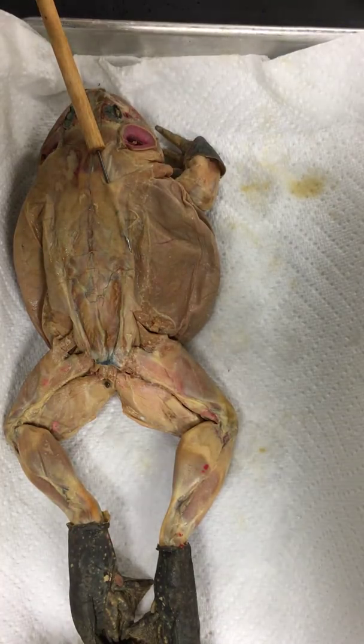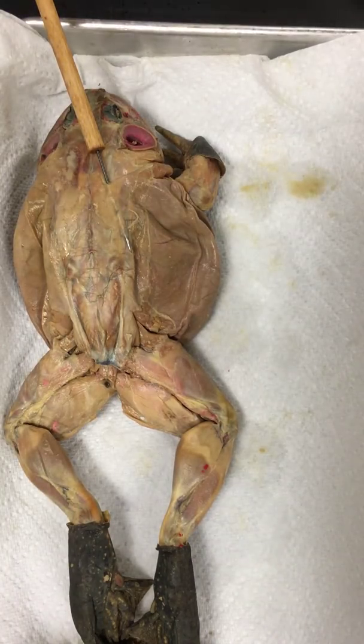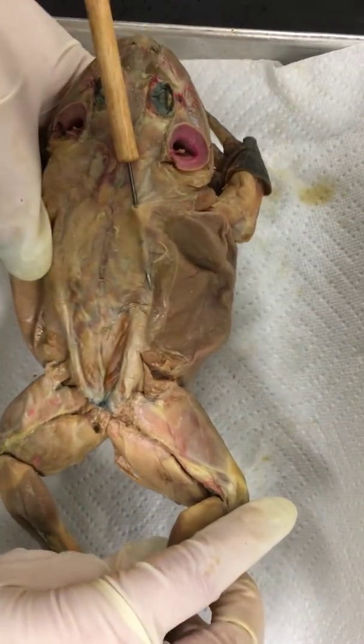Okay guys, it is objective four for the frog dissection and we're looking at the dorsal muscles. We have Froggy Von Froggersen here and I'm going to call out some of his muscles for you.